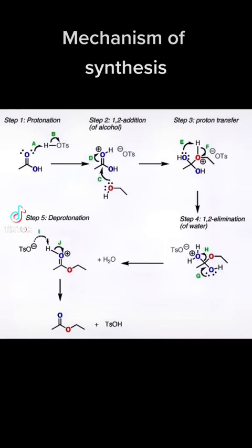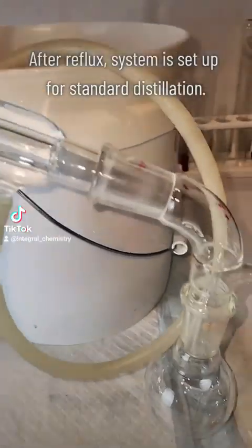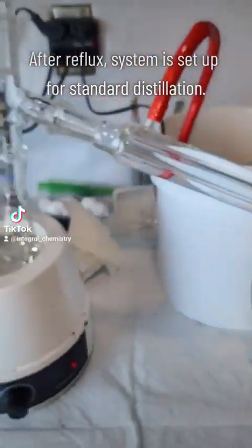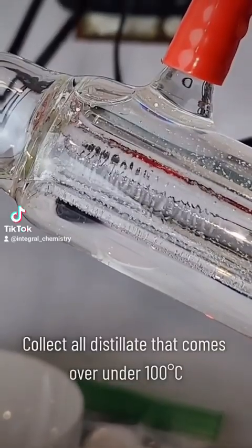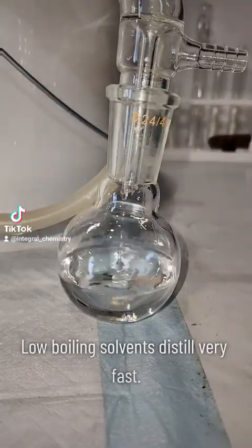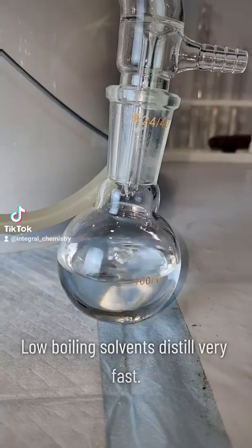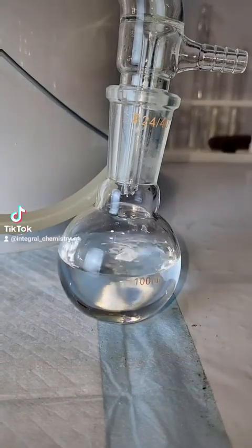Once the reflux is complete, I reset my system for a standard distillation and heat it to boiling. I'm going to collect all of my distillate that comes over below 100 degrees Celsius, which should be mostly ethyl acetate. This process happens very quickly because low boiling solvents like ethyl acetate tend to distill very quickly.